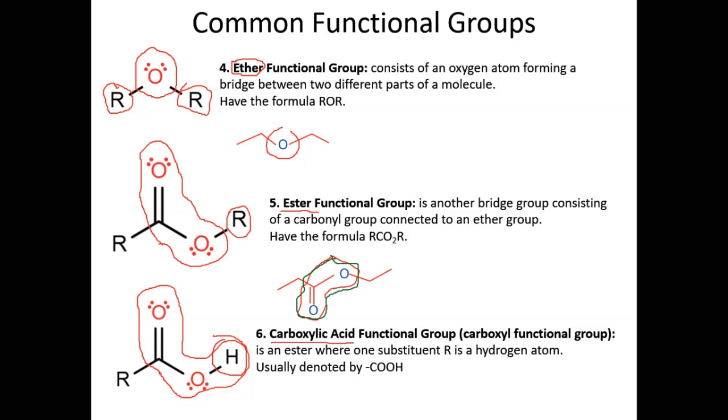And so now if we were to take this ester that we've drawn and show you what a carboxylic acid looks like. This would be a carboxylic acid.